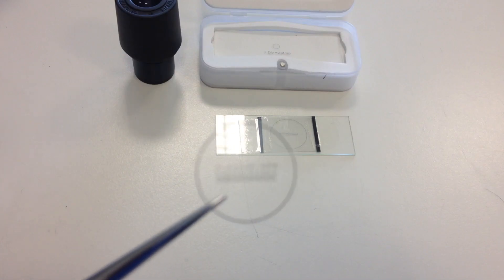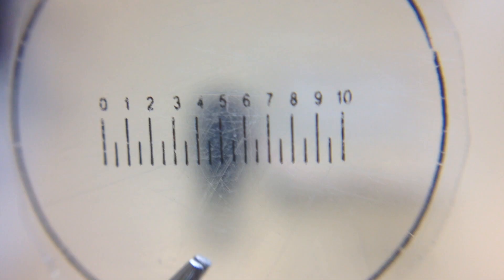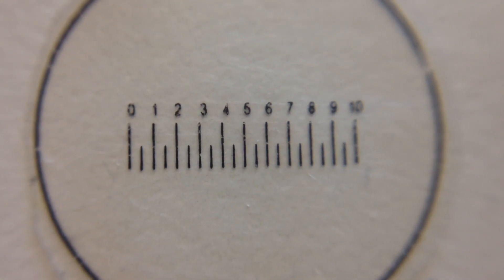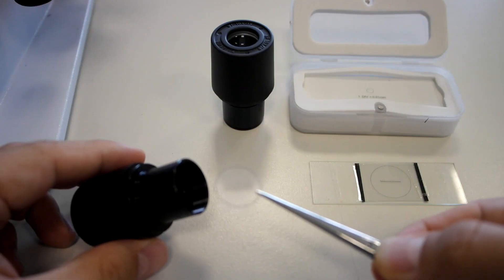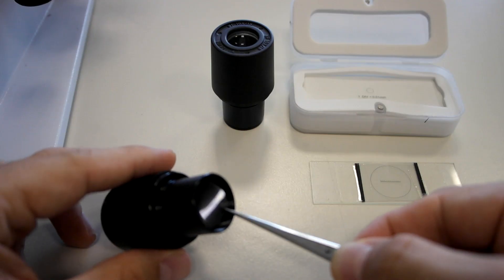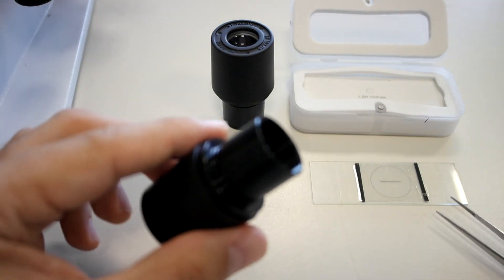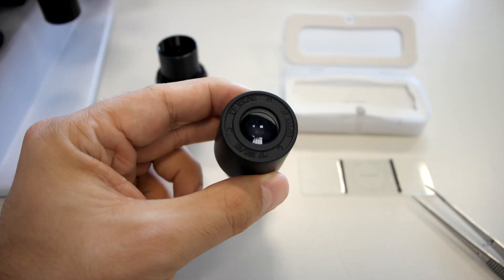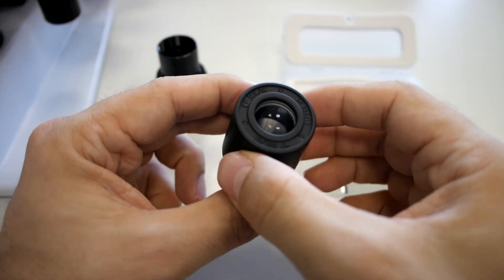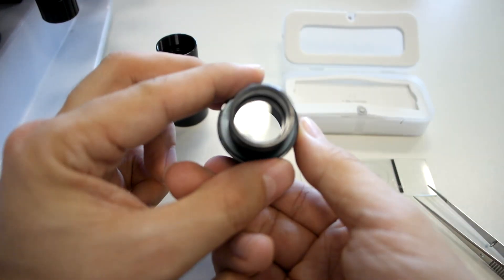This is the plastic eyepiece graticule that we insert into the eyepiece lens. The plastic eyepiece graticule is inserted into the eyepiece lens, but there is a better version — this eyepiece lens manufactured with the eyepiece graticule already engraved in it, so you don't have to put in any plastic. This is much better.